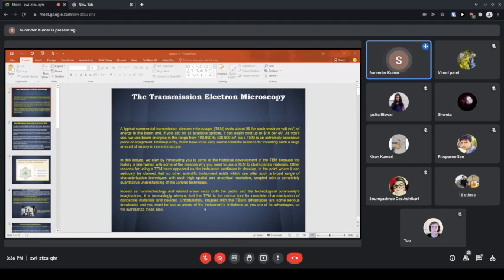You can see here these different signals are collected by the detector, and they carry particular information about the sample. Electrons are one type of ionizing radiation having charge, which has the capacity to remove tightly bound or inner core electrons.